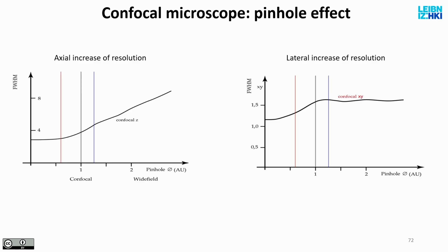Sometimes that's fine. Sometimes you have a structure which is very thin, and you don't care about this Z resolution, but actually you want to see, let's say, the entire nucleus. Then you open your pinhole, because the nucleus is big anyway, so you don't need the resolution.